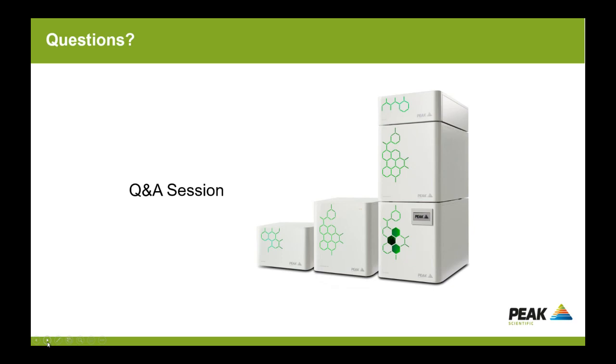So the next question, somebody has asked, can they use hydrogen carrier gas if there's no written method? So normally if you are developing your own in-house methods, there should be no restriction in terms of changing carrier gas. Of course, this will depend on what kind of analysis you're doing and if there are any other measures in place that you would need to consider.